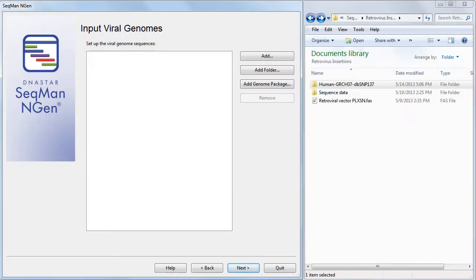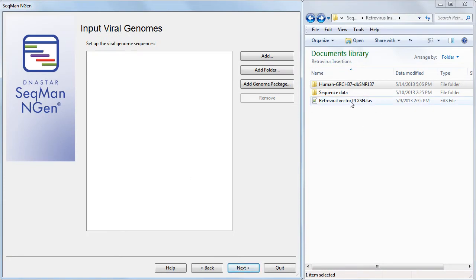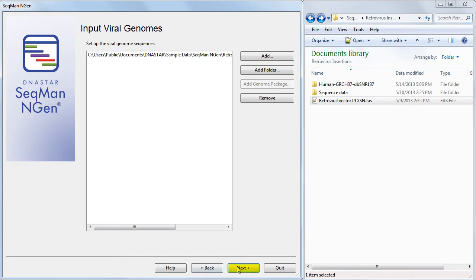In the Input Viral Genome screen, I'll add the Retroviral Vector Genome file, also by dragging and dropping it.